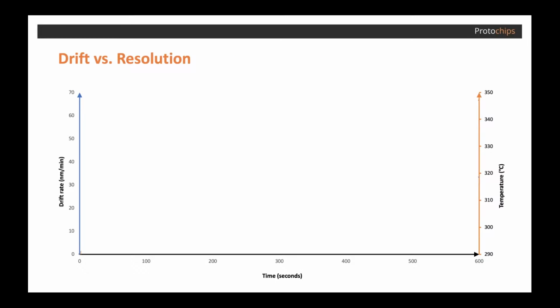So I think before we have a valuable conversation on drift, we should consider the many sources of it in typical TEM work. A new TEM today has a fundamental resolution specification that's deliverable if the drift at the time of data acquisition does not exceed a level of around 0.5 nanometers per minute. And I show that here in the dotted orange baseline on this graph. When working above this level, there's going to be some compromise or corrections that may be required to maximize captured data quality. And there's many sources that can contribute to an increased level of drift.